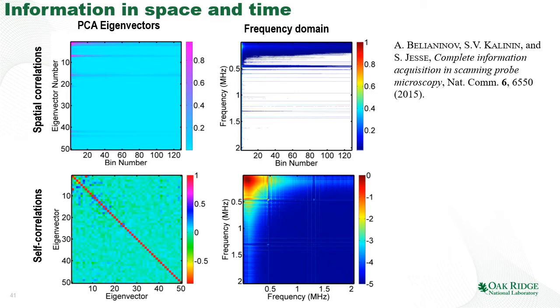Some of them, however, have strong spatial variability, and therefore it offers us a way to denoise the signals. For example, we can take the eigenvector and loading maps that contain spatial information and throw away everything else. So there are a lot of ways you can do this, much like you can do a lot with the classical TV and video compression scheme.